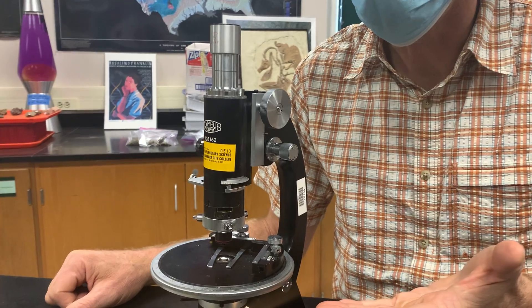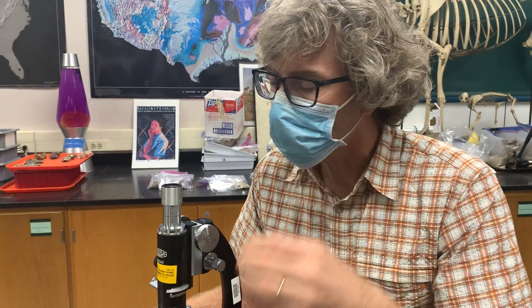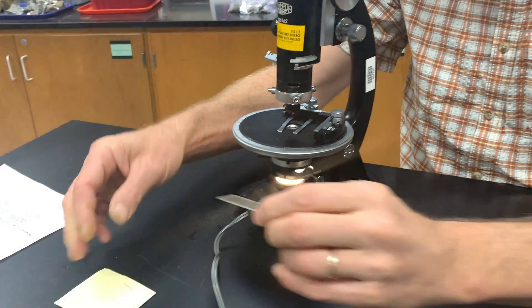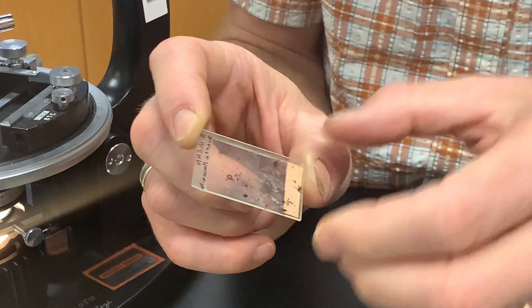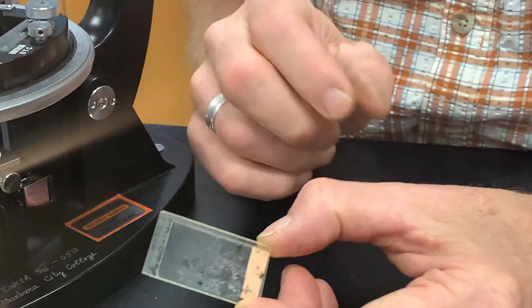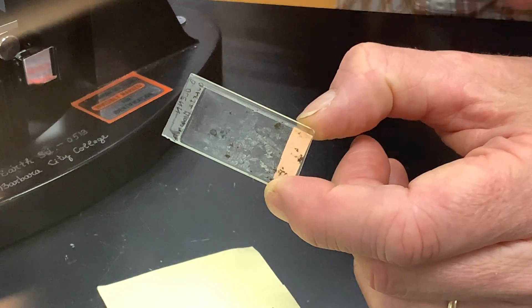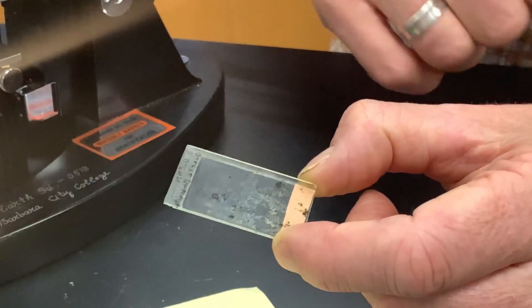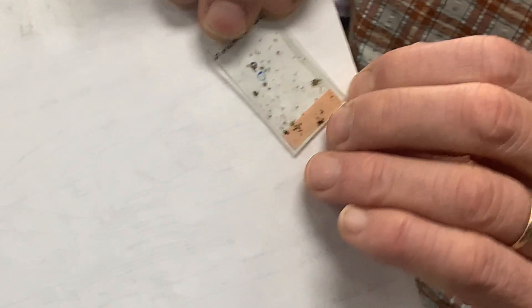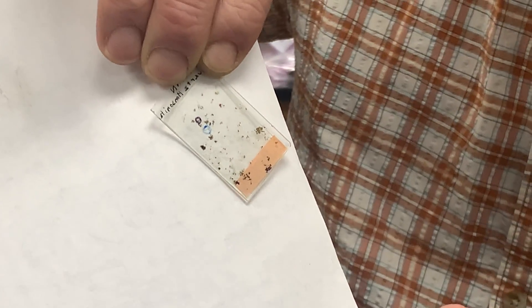One of the things these microscopes do is enable you to get a magnified, transmitted light view of whatever you're looking at. What we're going to be looking at are thin sections of rock. These are 30 microns thick if they've been made to standard dimensions — that's like a third of the thickness of a typical human hair. They're thin enough that even ferromagnesian minerals you'd find in a mafic rock, like pyroxene or hornblende, which look jet black in a rock, you can see light through them. You can even see some of the minerals here; these dark specks are probably a combination of biotite and hornblende, and when we look at them through the microscope, we can see right through them.